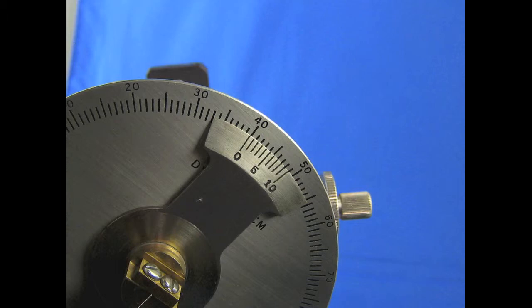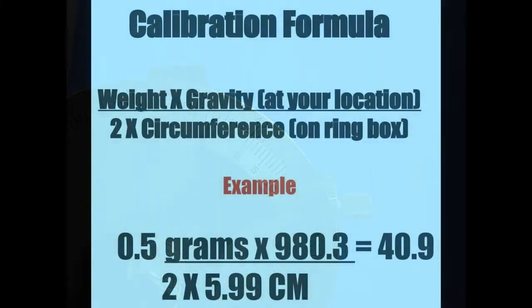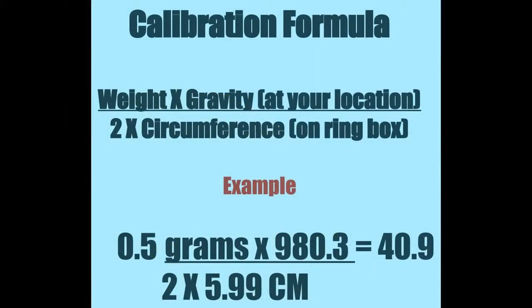Set up to calculate the calibration number. This is the weight put on the ring times the gravity at your location. You can get this from the National Geodetic Survey. This number is divided by two times the ring circumference. The ring circumference is printed on the ring box label.